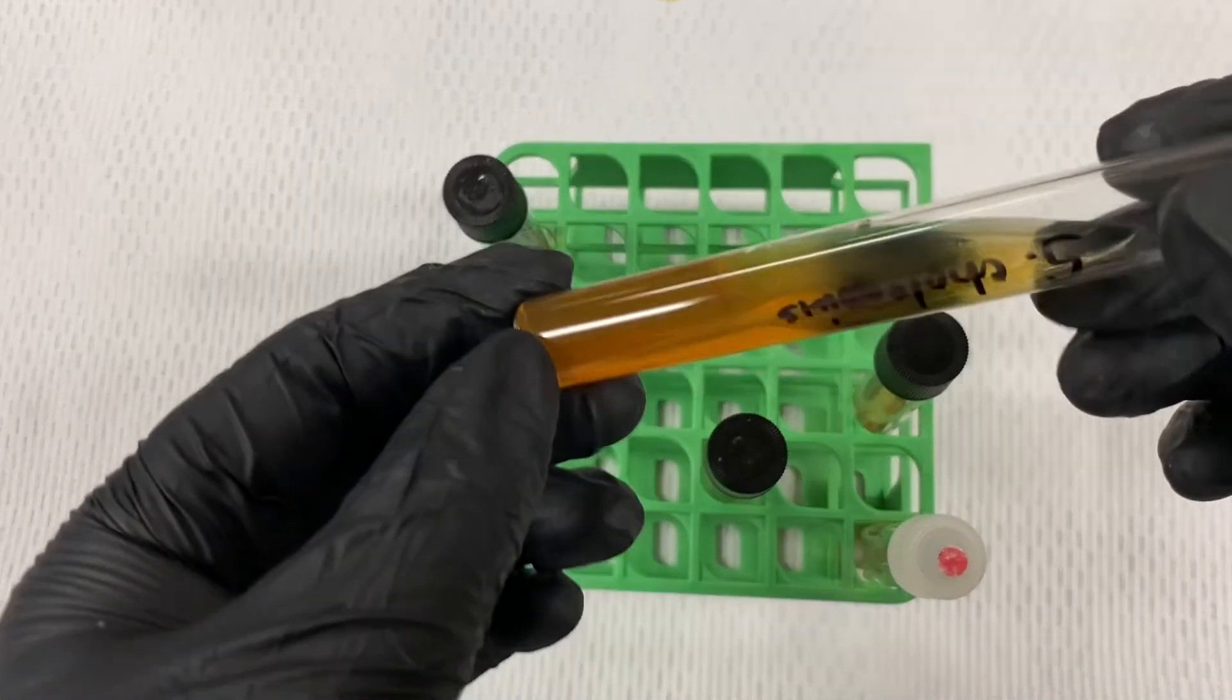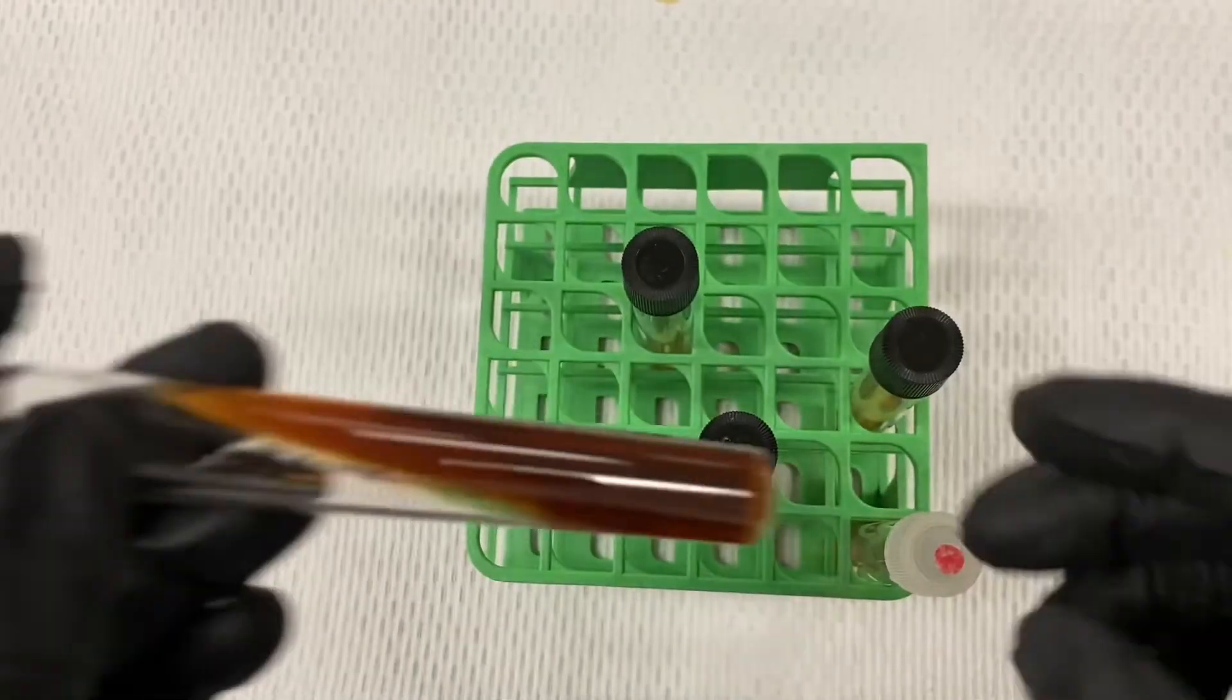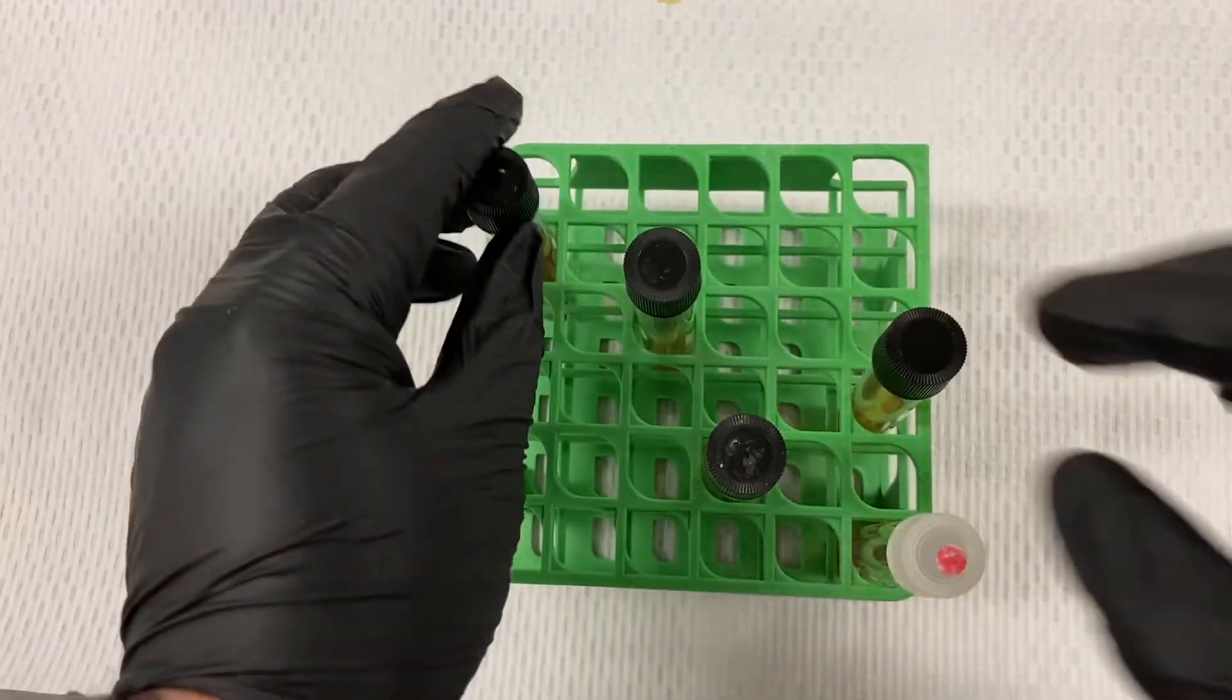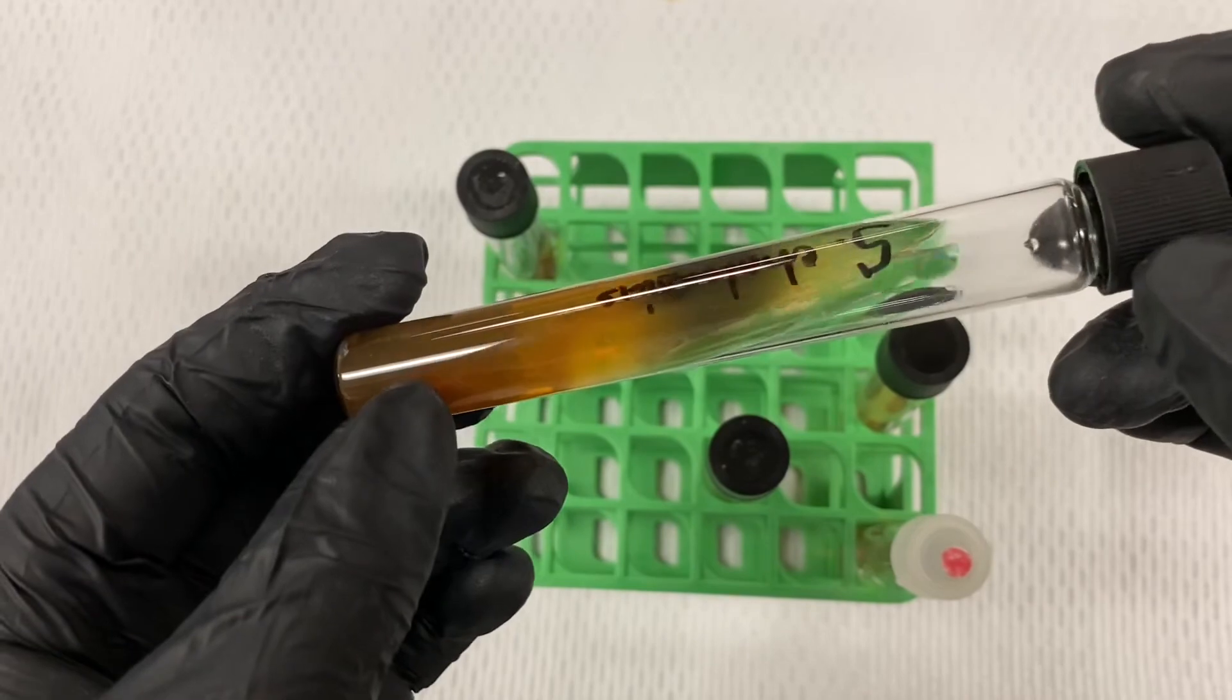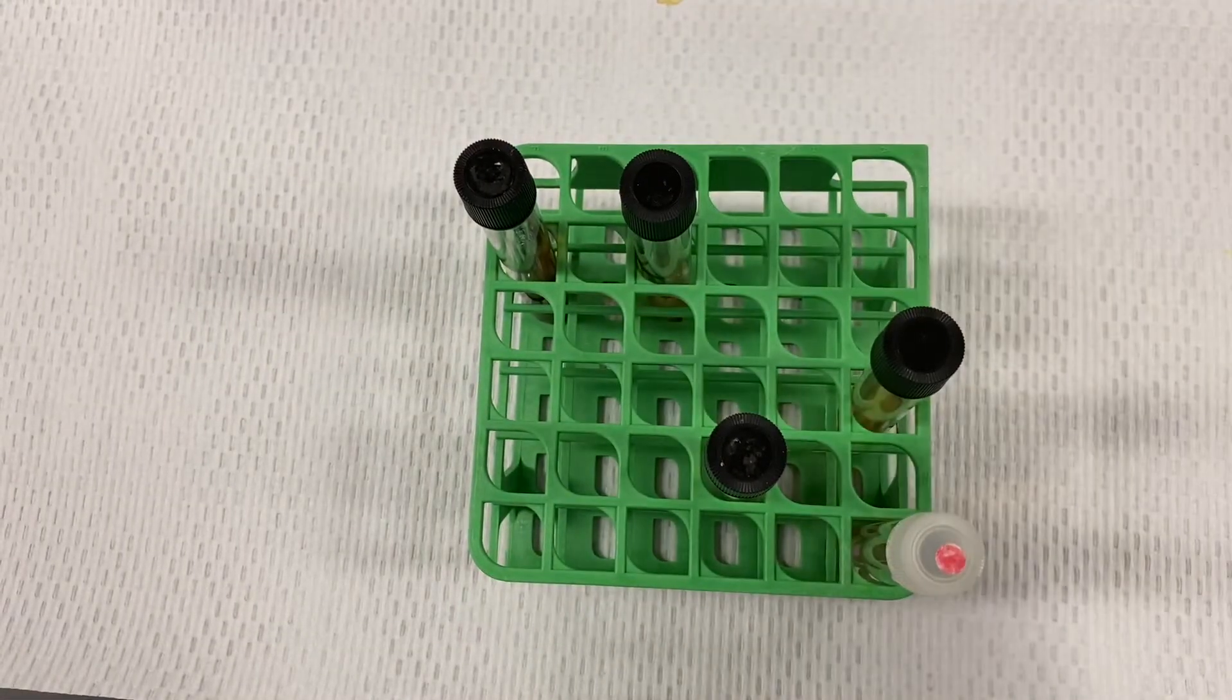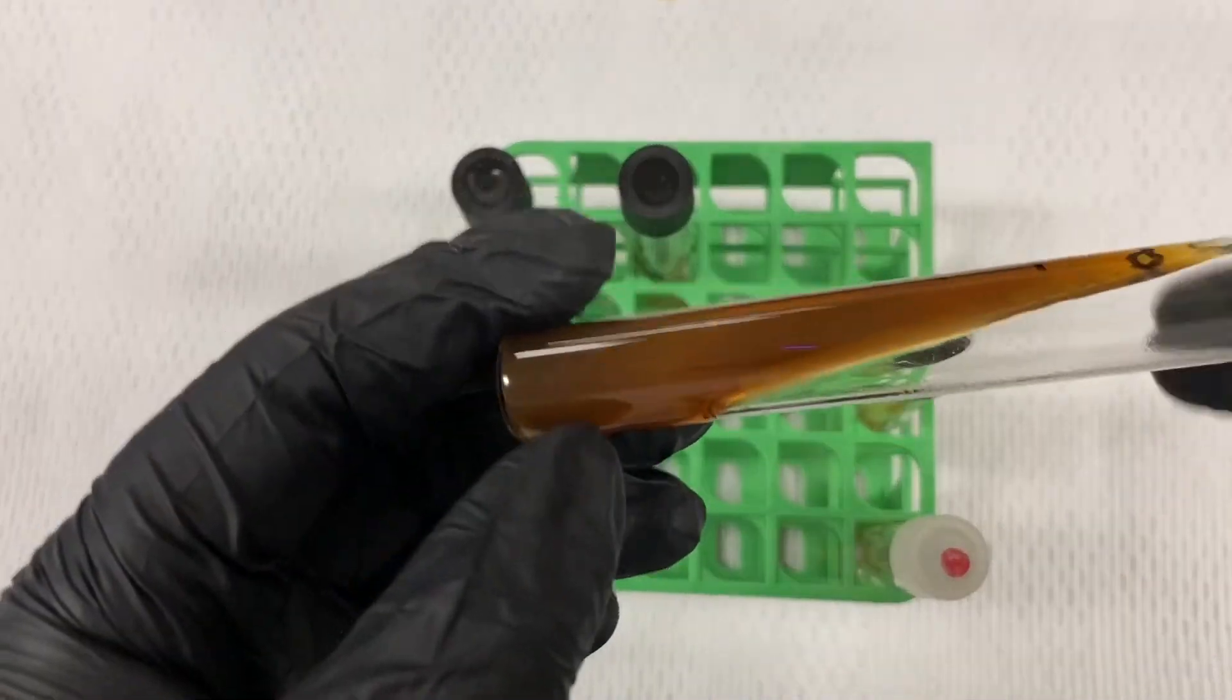And any type of fermentation. So what we look for specifically is if we have no change, it is negative for that particular test. If we see black colors, this is the production of hydrogen sulfide, in other words positive for the removal of sulfur from cysteine. And at times what we're also looking for is the presence of gas.